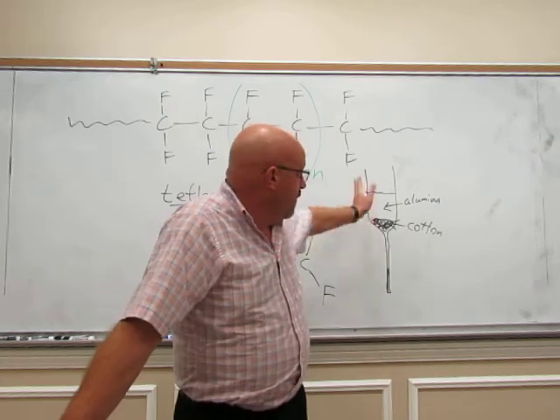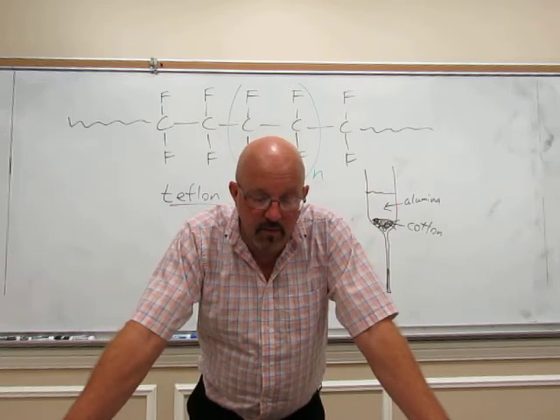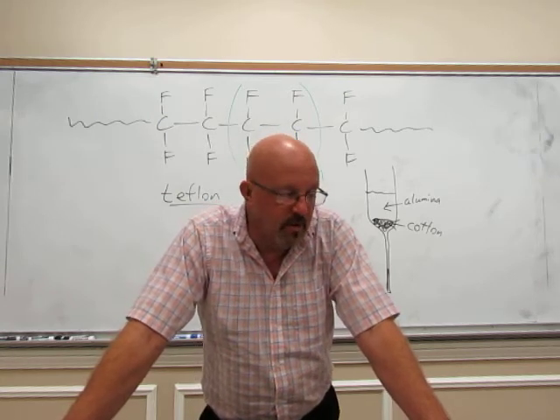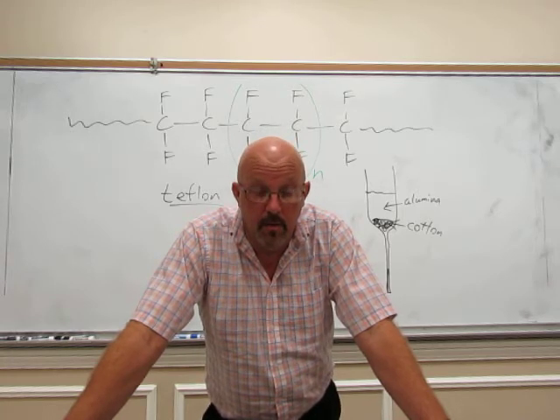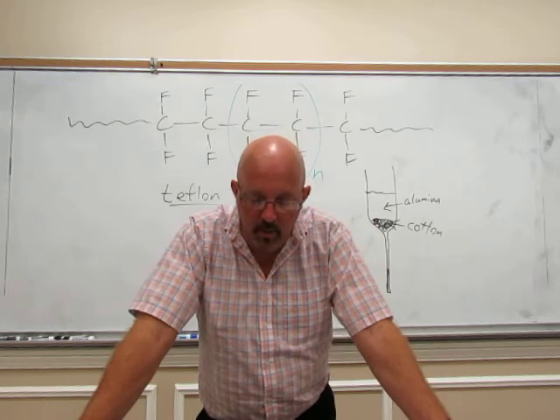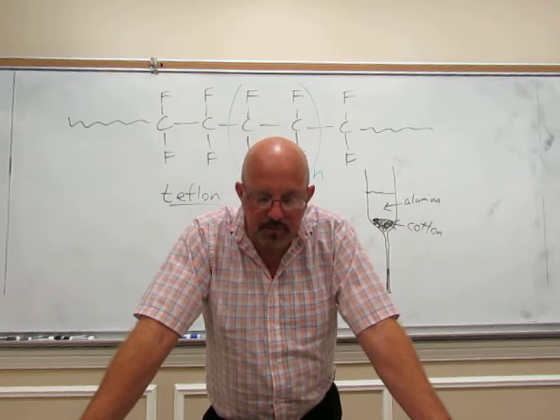So this has removed our inhibitor, and then we'll do the polymerization. You're going to add 50 milligrams of benzoyl peroxide and a wooden boiling stick, and then heat that over a sand bath. Polymerization should begin around 135 degrees. However, you are not going to put the thermometer in the reaction tube or in the disposable test tube. Otherwise, we'll have polymer all over the thermometer, and I don't want that. So just assume that it's 135 degrees.